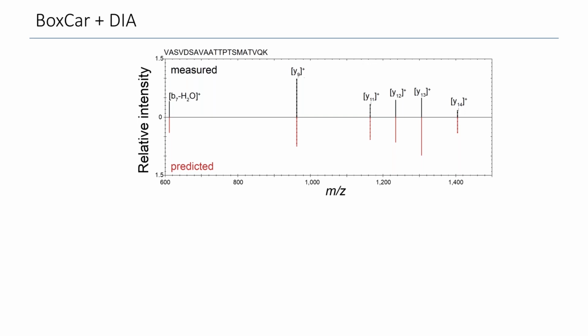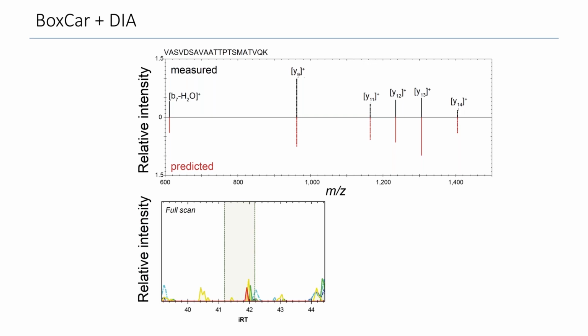So we can be sure that the peptide of interest is there because we see its fragment ions. However, when we look at the MS1 scans at the very same retention time, we could not find any precursor signal that would fit to these fragment ions. So that's kind of a weird situation where you know that something is there, but you don't see it.